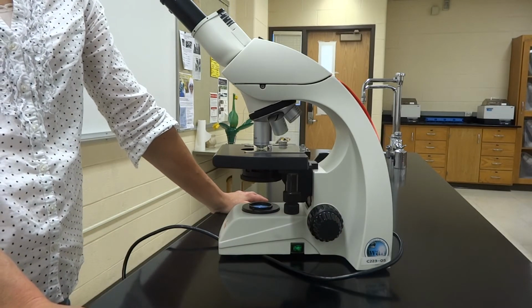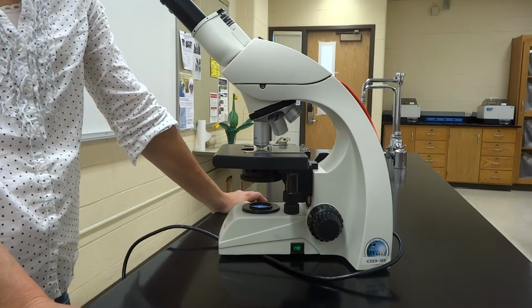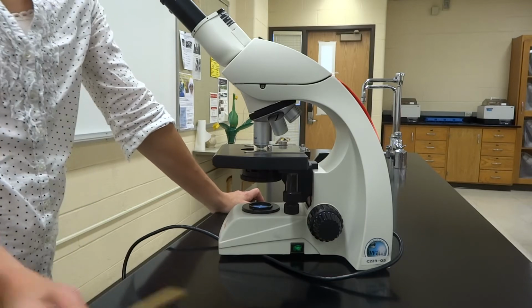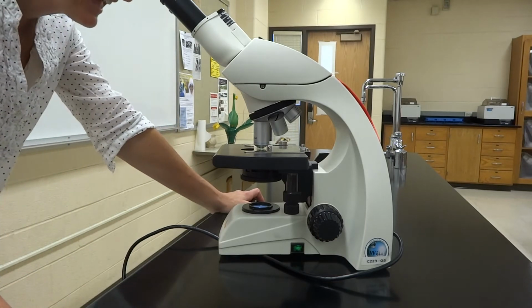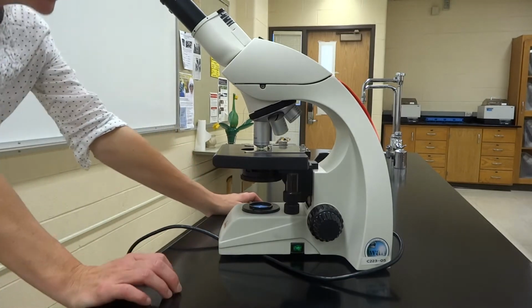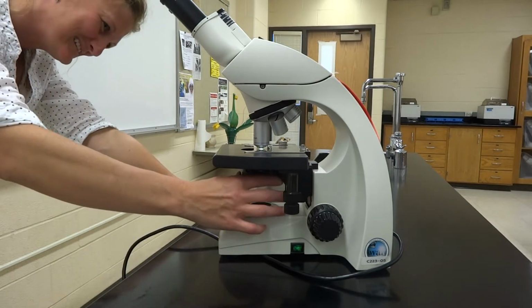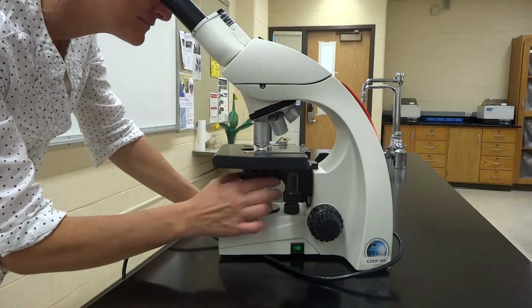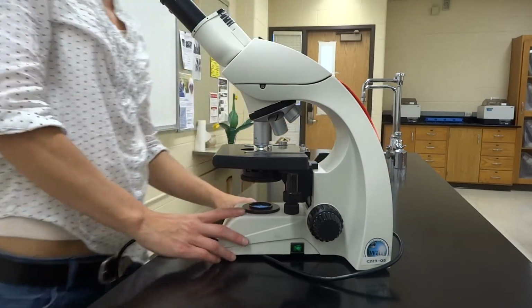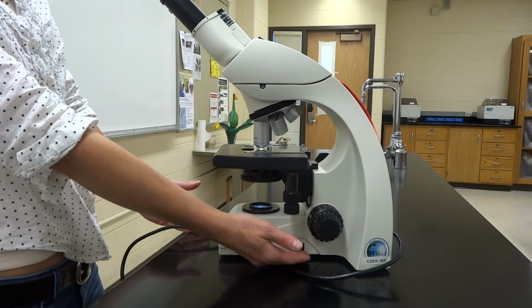Now as you move from 10 to 40, Liz, what did you notice about the light? It decreased. It got dark. Dim. So how can you fix the dimmer light? Well, I could increase the light by using the condenser iris diaphragm. So remember, we have the diaphragm underneath, and there is also that little knob on the other side of the scope. You don't have to turn it. They know where it is. It's on the side opposite of the on-off side.